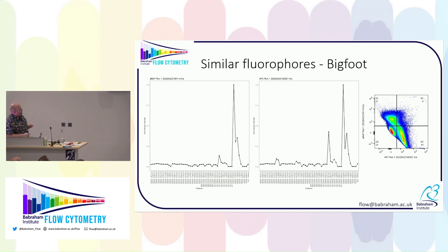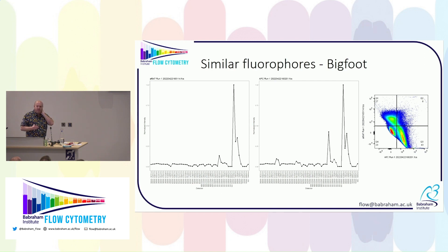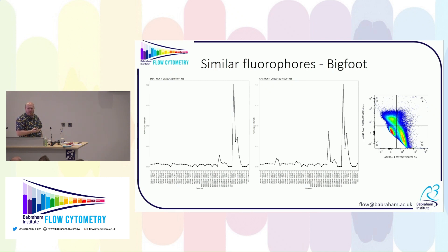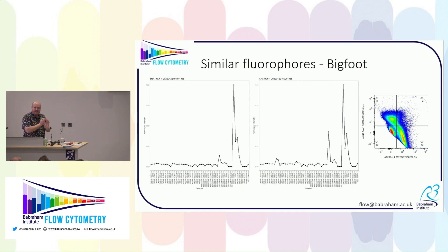Here's an example: Alexa Fluor 647 and APC. Their normalised spectra are extremely similar, but APC has this UV emission — people knew about this UV emission 10–15 years ago when UV lasers started appearing on the LSR. On a traditional spectral plot you don't see the UV emission because the emission lines never went into the UV region. But on the LSR you could see it, and people were always confused that you had to compensate from the UV with APC.